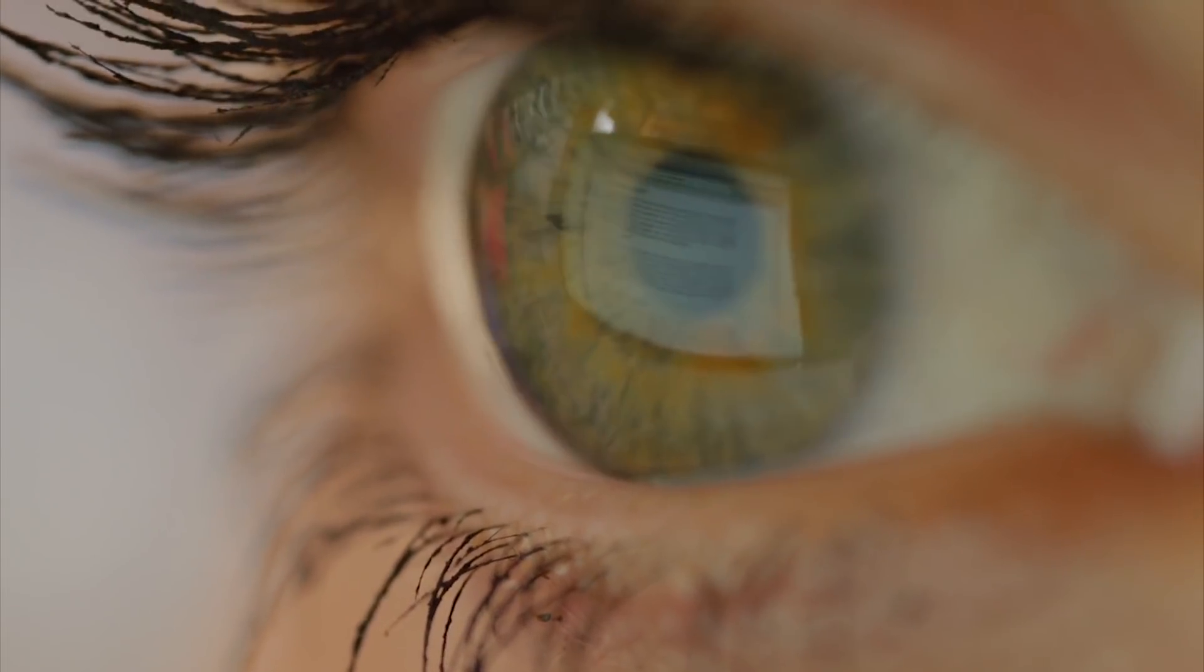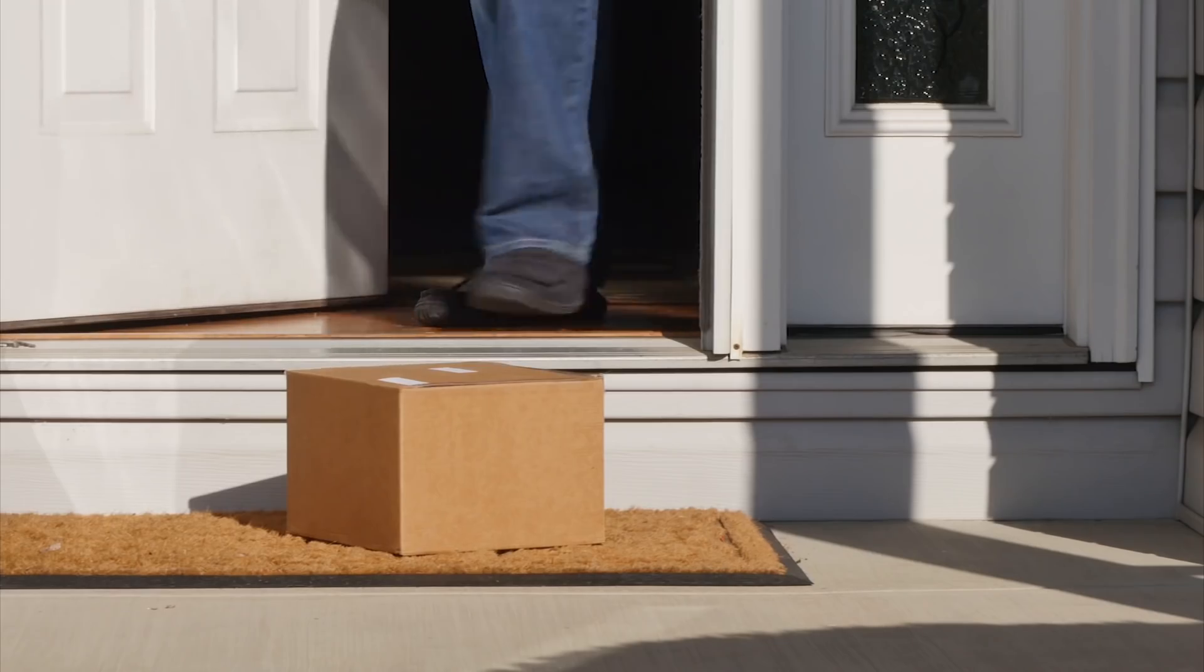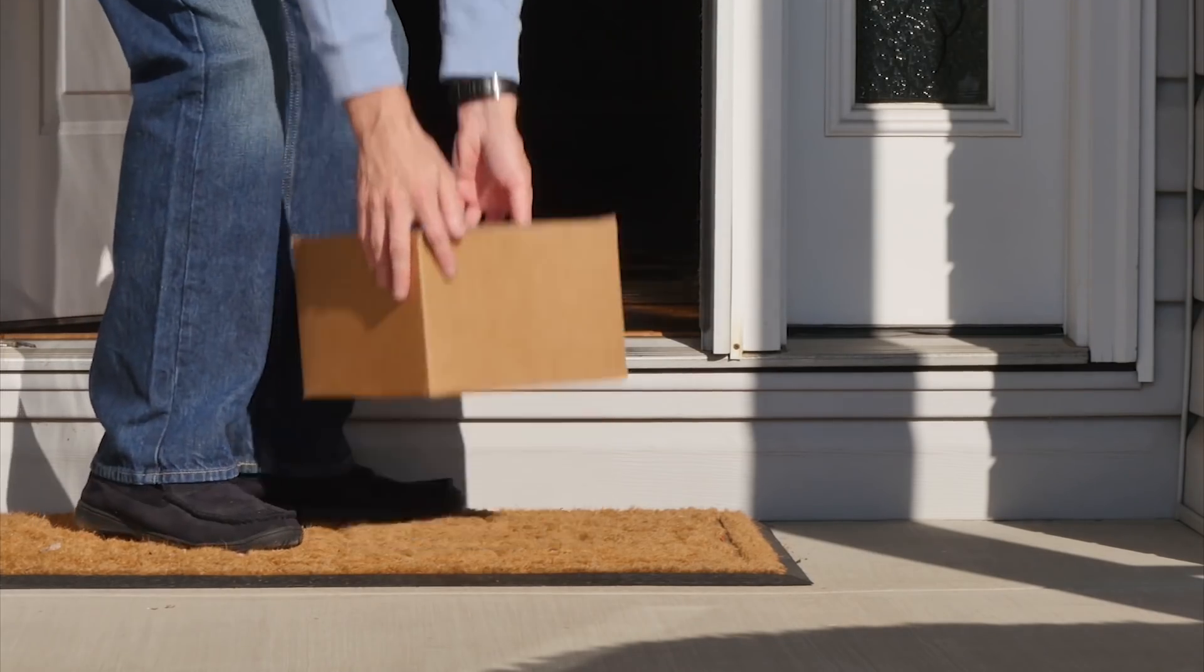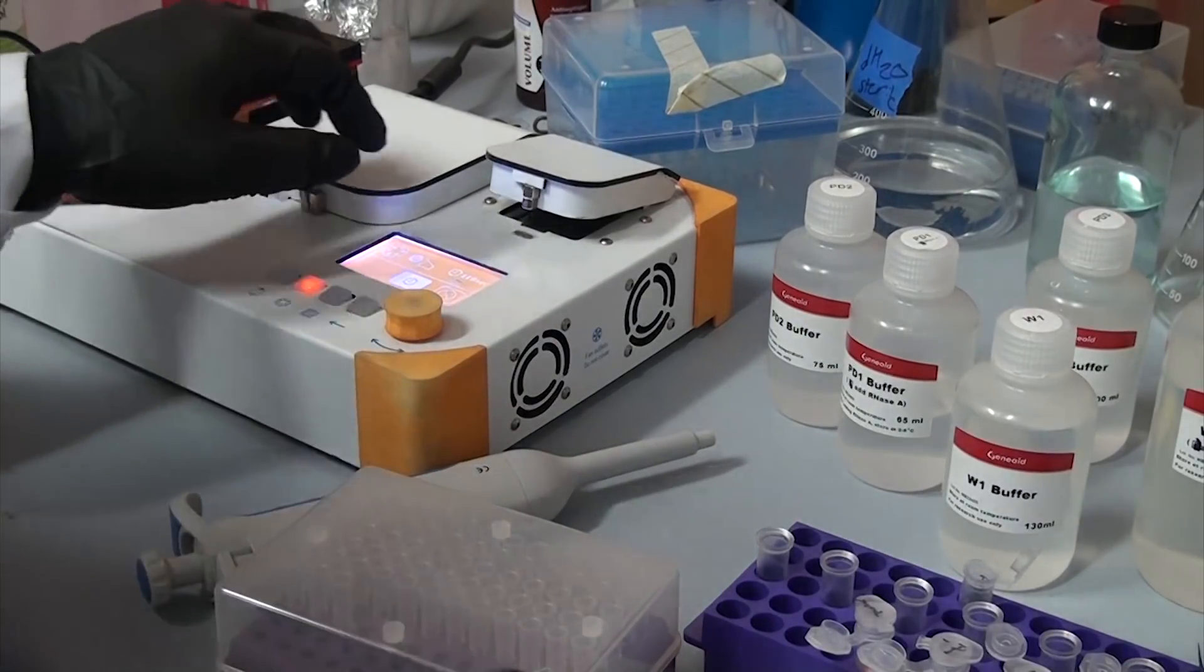What usually ends up happening is you shop around, look at all the different products and protocols, and see if you can find one that says it does the thing you're trying to do. Then you order those supplies, try it out, and see what happens. Maybe it works right off the bat, but often you'll end up having to try a couple others before you find one that gives you good results.